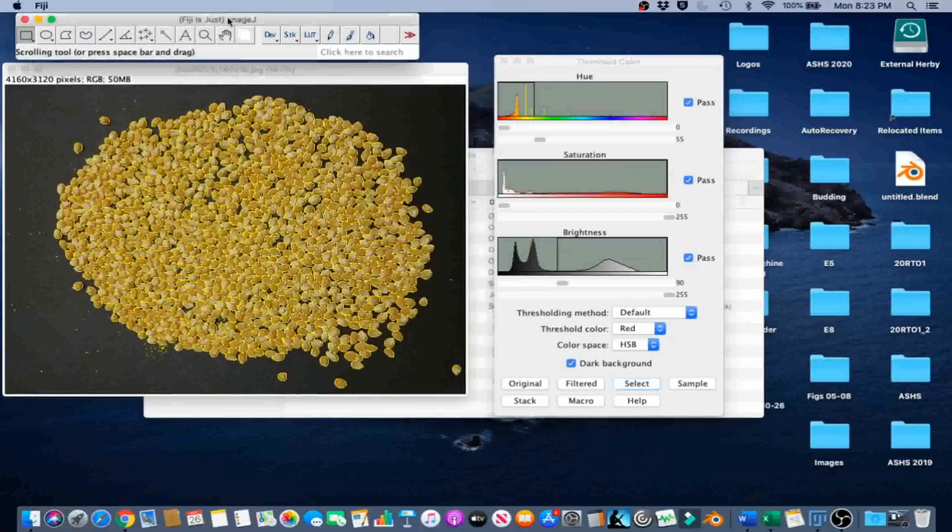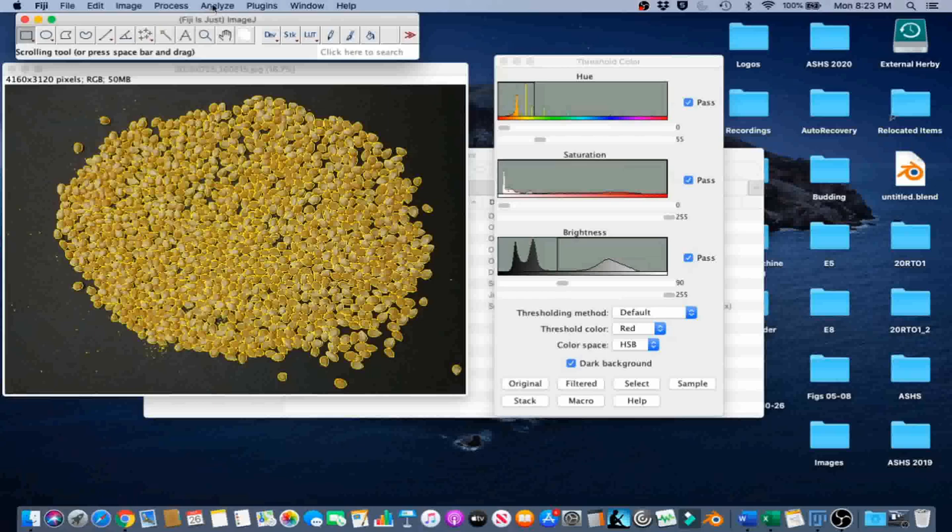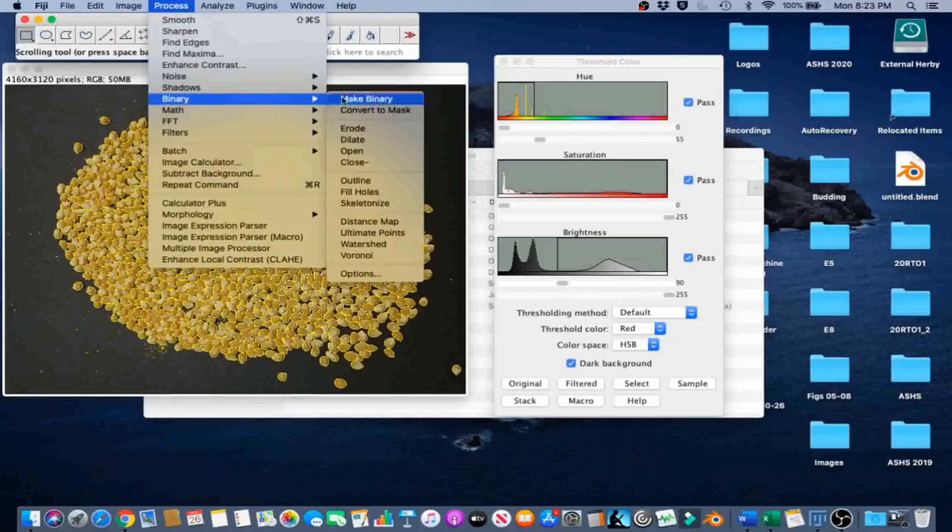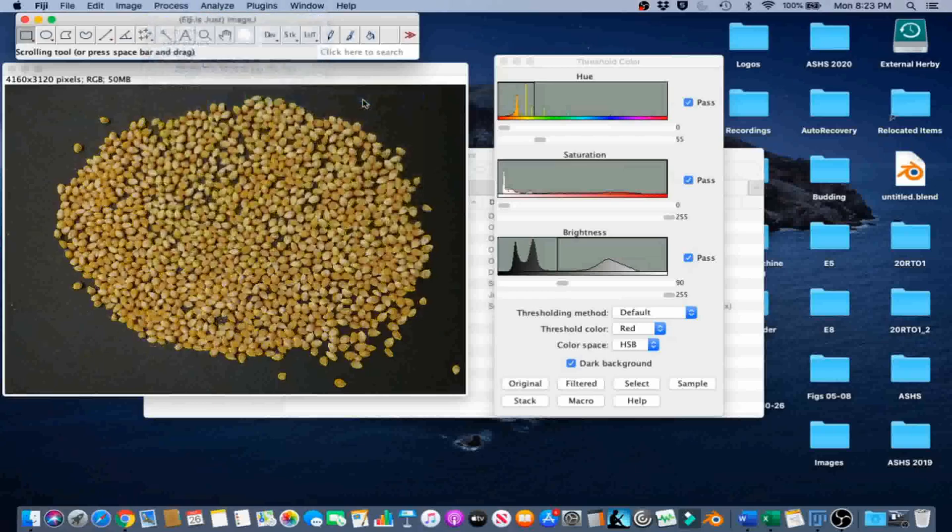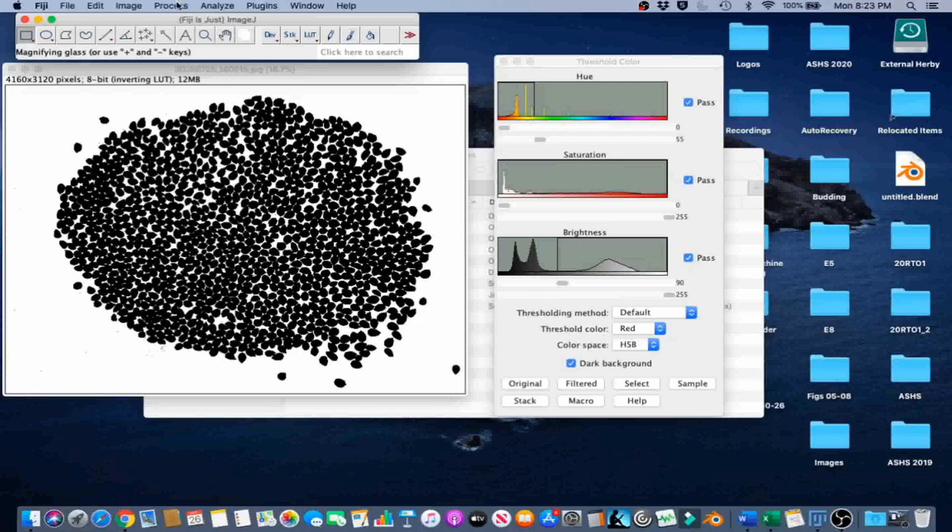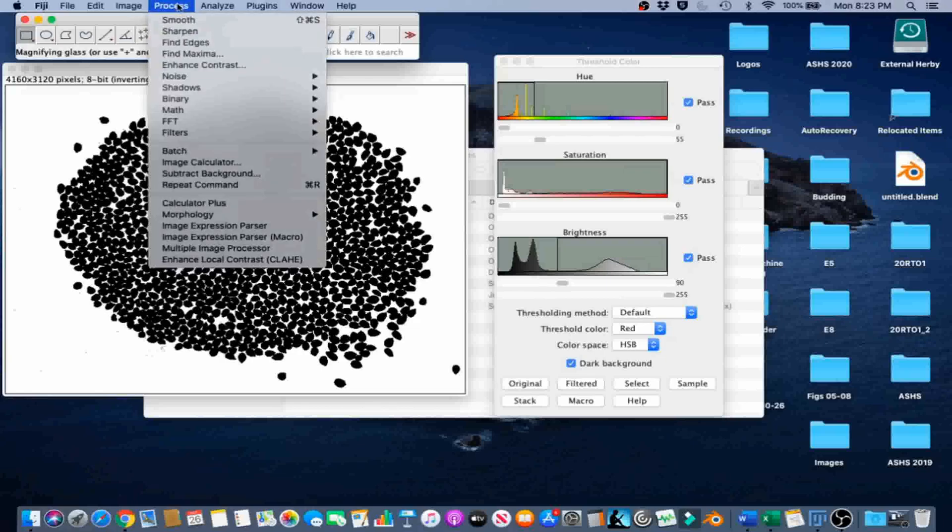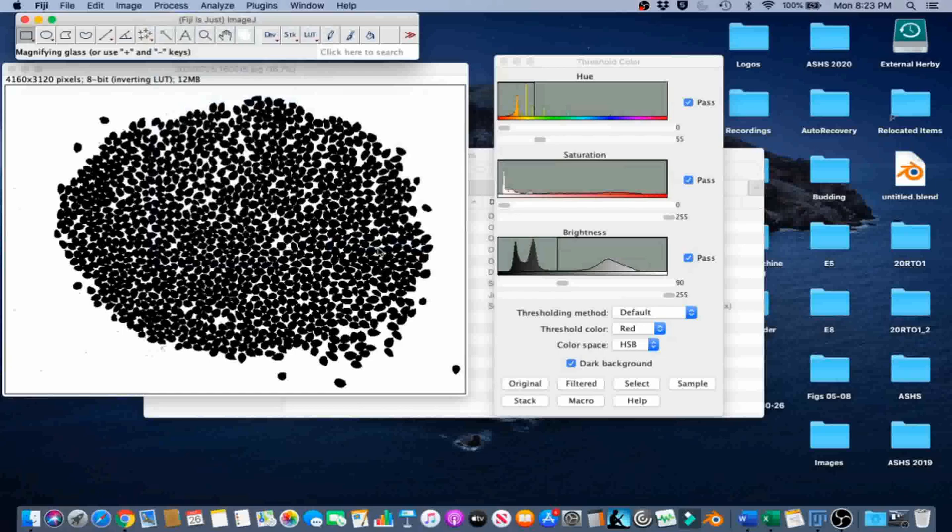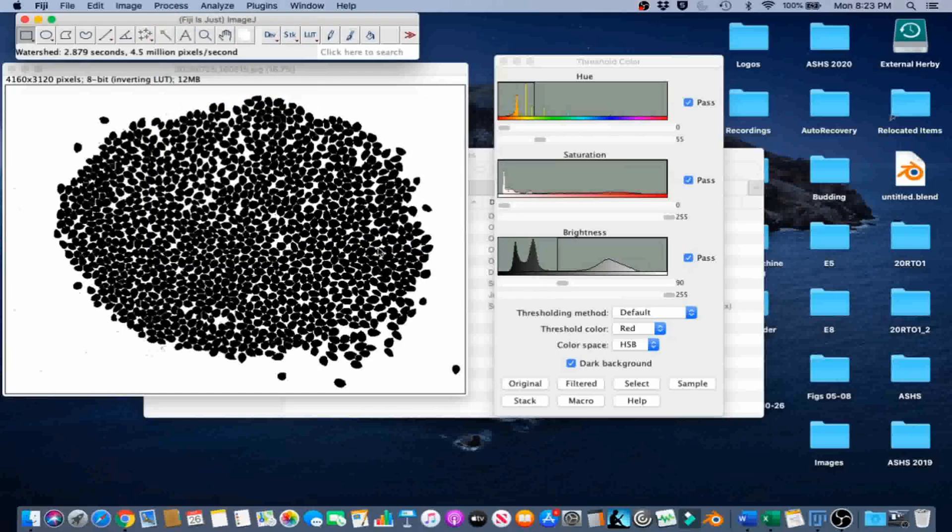Next, go to Process, Binary, Make Binary to convert the color image to a binary image. Then go to Process, Binary, Watershed to add a single pixel line between all of the seeds, or in this case, all the pixel clusters in general.